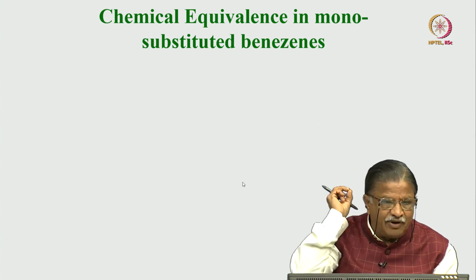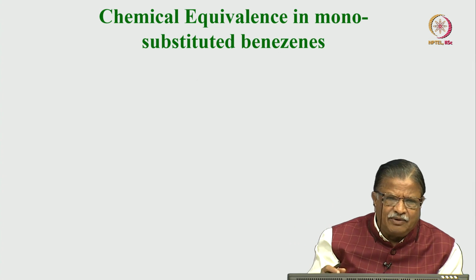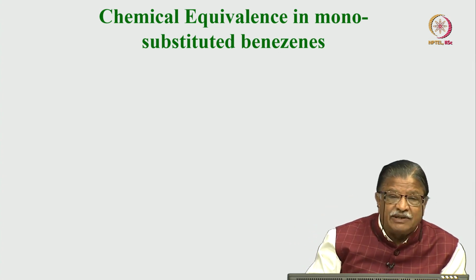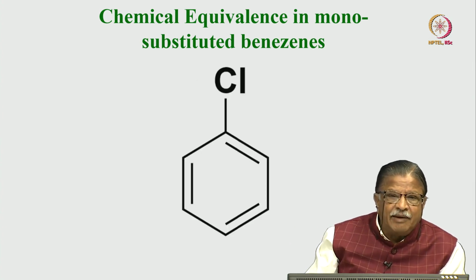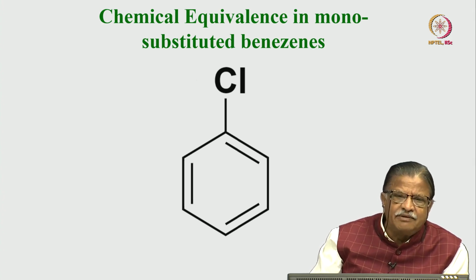See, most of the time when you are dealing with organic molecules, they need not be aliphatic; you come across phenyl groups present in the molecules. Let us consider the chemical equivalence in monosubstituted benzenes. Take monochlorobenzene.